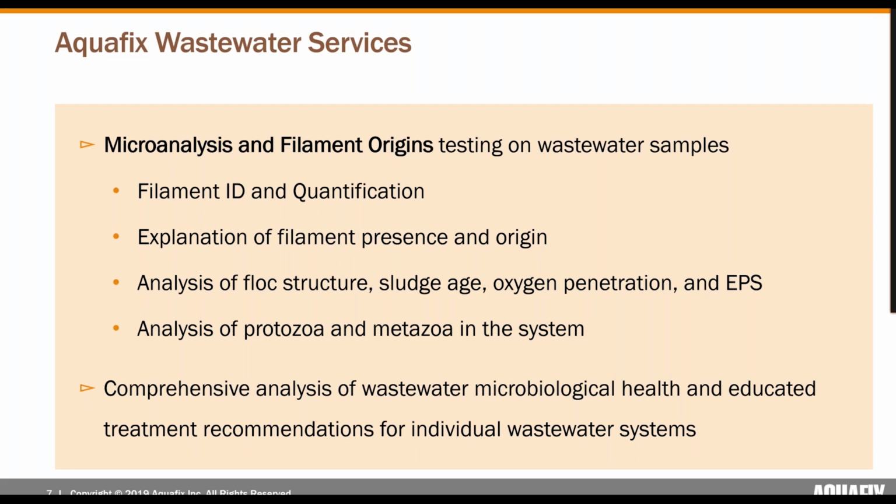And so really, through all these observations, we are going to be able to conduct a comprehensive analysis of the wastewater microbiological health within a sample and a system, and through that make educated treatment recommendations for specific wastewater systems that we're looking at and analyzing. And so we're going to explore this analysis further throughout the rest of this presentation and explain how we conduct our analysis and what we look at when we're looking at a wastewater sample to determine overall health, floc formation, as well as treatment efficiency.